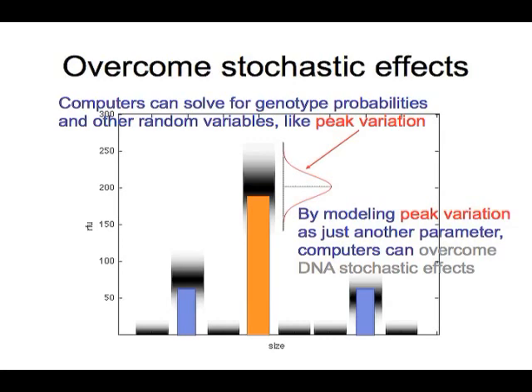observed STR data. In the same way that thresholds are a very crude, one-size-fits-all way across all the data of trying to establish some control over stochastic effects, with modern statistical computation, which started about 20 years ago with the Gelfand and Smith article, if you want to be erudite and reference it, but you don't have to, computers can now determine the variation not across the laboratory, but for every STR peak in your data. It's a much more refined approach that only computers and probability modeling can do. And that's why you no longer need thresholds, because the computer is determining your certainty to a far greater extent than is possible by drawing one line for your entire laboratory.